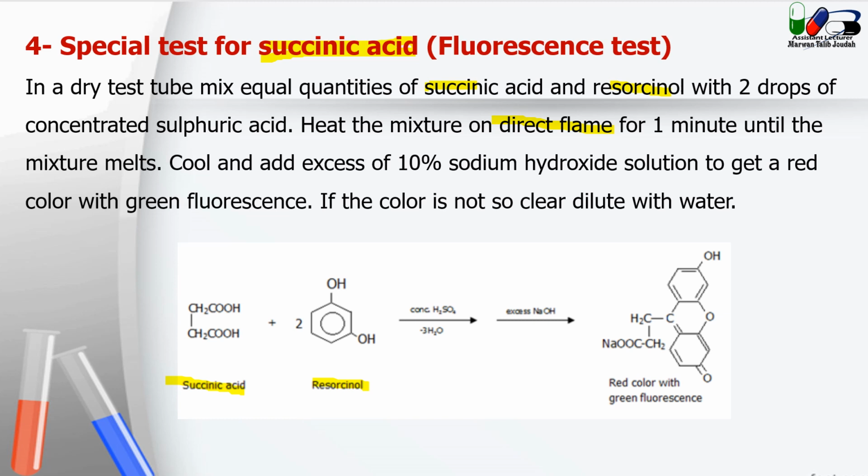This is the reaction: succinic acid, resorcinol, concentrated sulfuric acid, and excess sodium hydroxide. Okay, and then you will get a red color with the green fluorescence, which is this one.